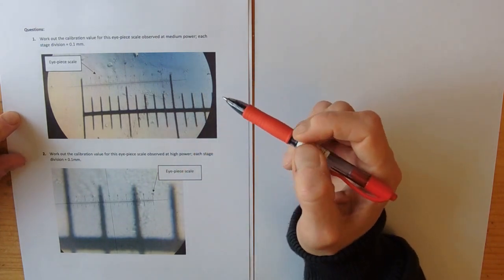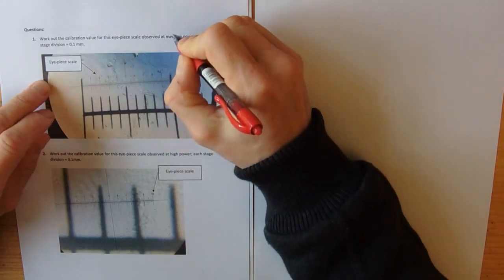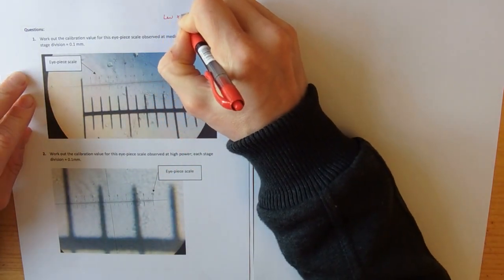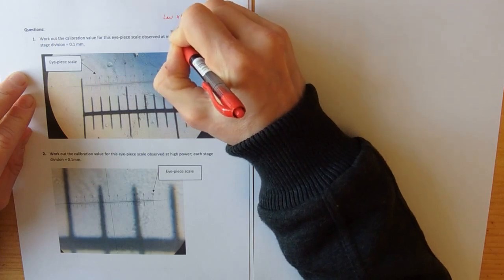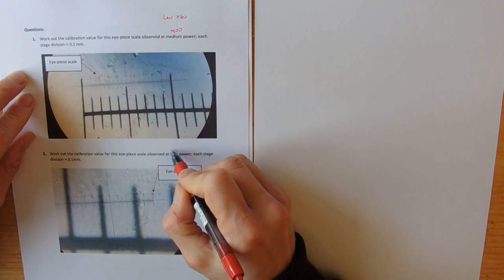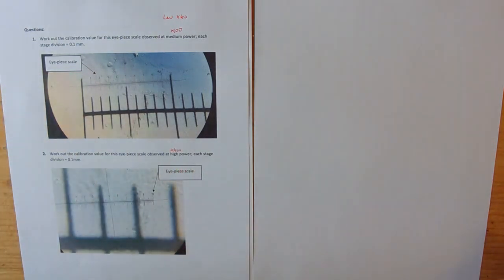Work out the calibration value for this eyepiece scale observed at medium power. Each stage division is 0.1 millimeter. So you've done the low power, which was times 40, medium, that's usually times 100, and then later on if we do a high power one, that's going to be times 400. So hopefully you've done the low power one.